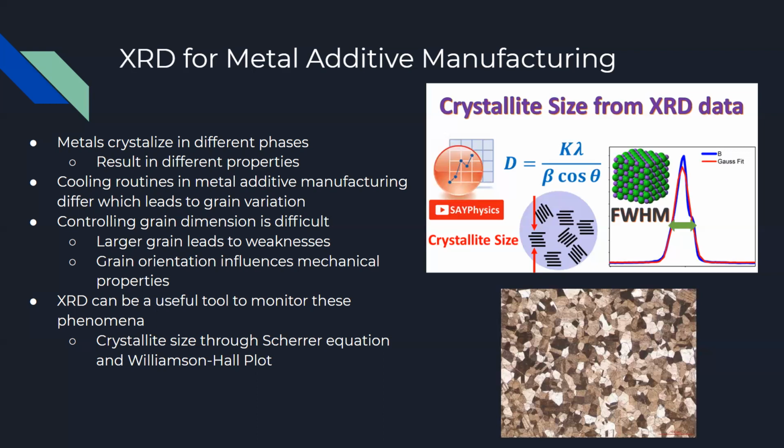So the way in which X-ray diffraction will help this is by characterizing the X-ray diffraction patterns of the sample and comparing them to the nominal patterns of the material. If there are discrepancies, then something could be up. Grains could be different than normal, impurities can be present, list goes on. Using the Scherrer equation, we can determine the crystallite sizes by knowing the angle and wavelength of light. Whatever the desired crystallite size is can be compared to the experimental. Once again, if there's a discrepancy, changes to the substance can be made to correct these issues.